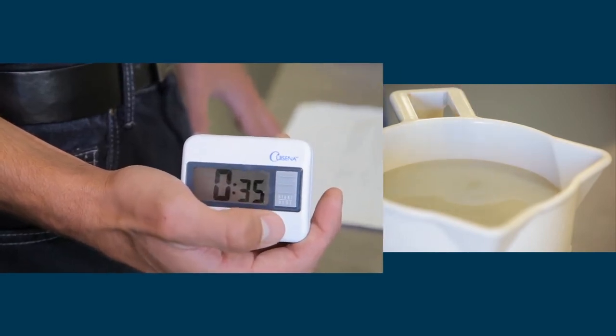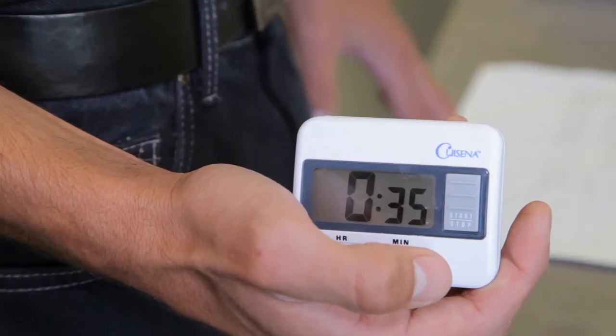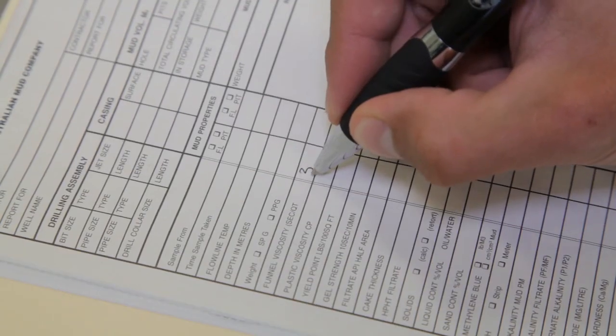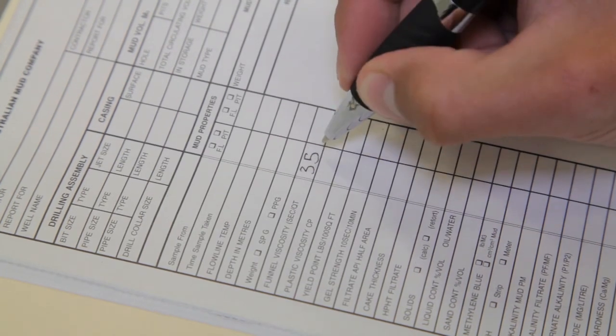This drilling fluid has taken 35 seconds. The funnel viscosity is noted down as 35 seconds.